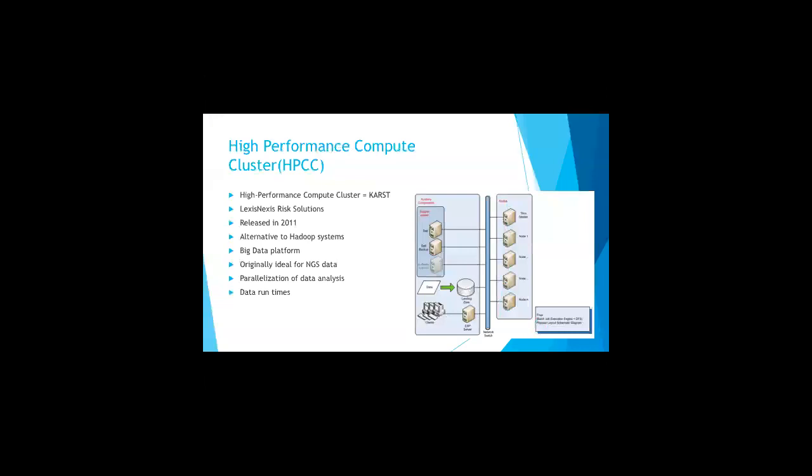So when you submit a job to it, it lets you do parallel sequencing for these massive files. So it doesn't do just one nucleotide at a time. It doesn't do just one read at a time. It'll divide your job into large nodes into different places. You may get 2 nodes. You may get 4 nodes. You're going to go into a queue, so it may take you a while to get through this.